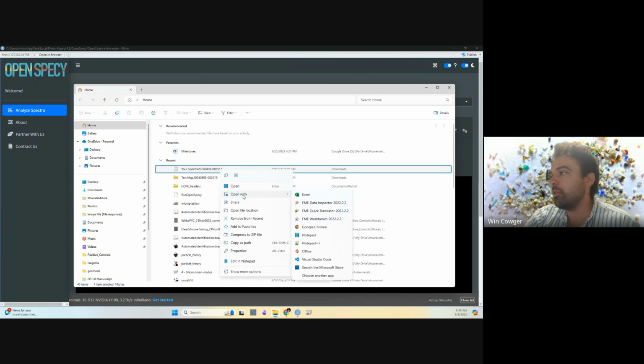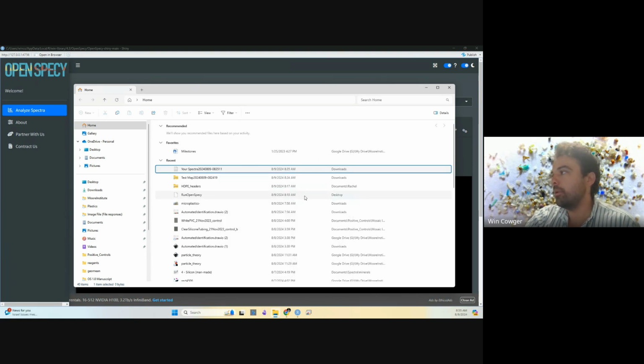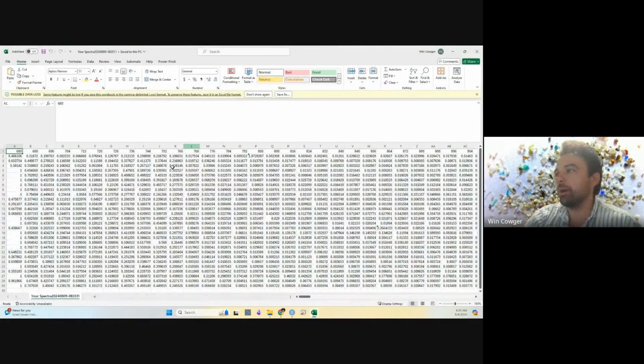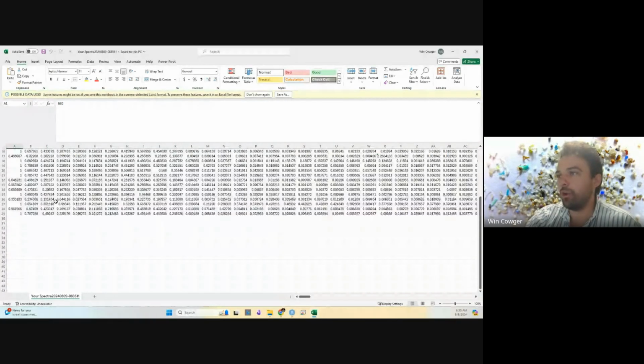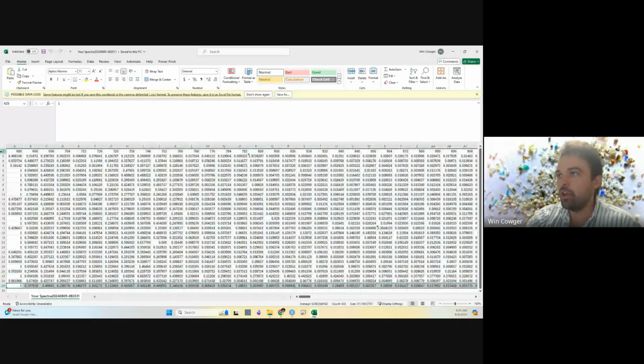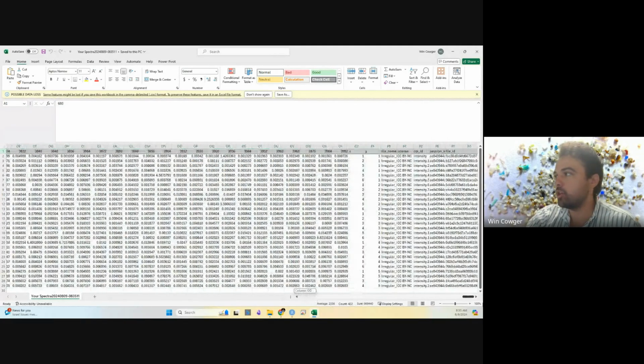It's in a bit of a unique format, and it's really because we're trying to preserve metadata. But basically, for our 28 spectra, in the format of the data set, you have wave number values on top, and then any metadata should be at the end.